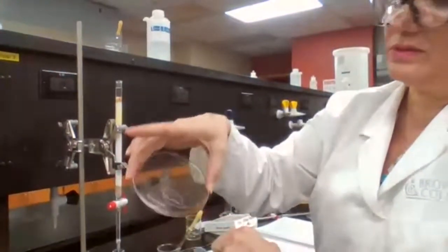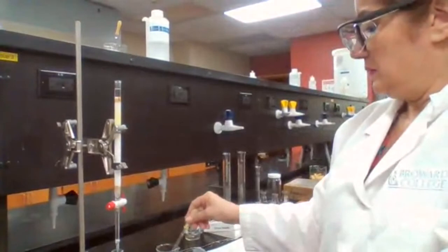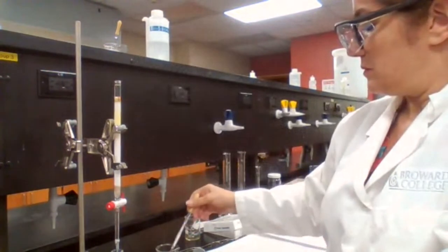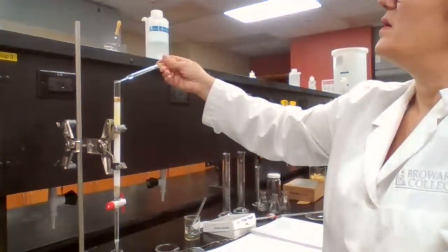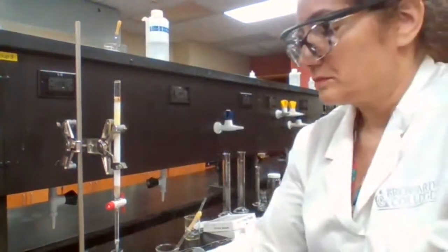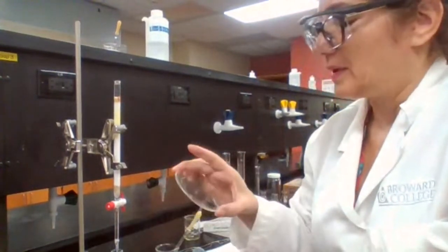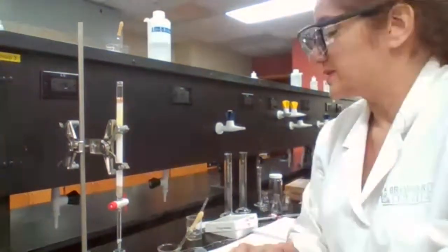If it's white residue, that means you're collecting fluorene. Still present.